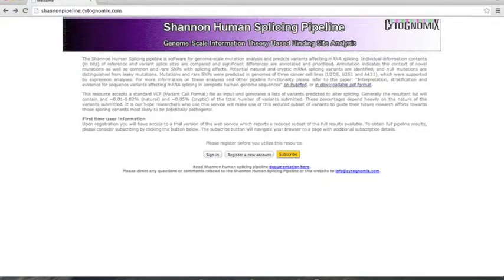The purpose of this video is to provide an overview of the web service and to show you how to use its main functions. To do that, I'll be executing an analysis and briefly going over the results. For more information on the results themselves, please watch the video on the results page, or you can also find it in the documentation.